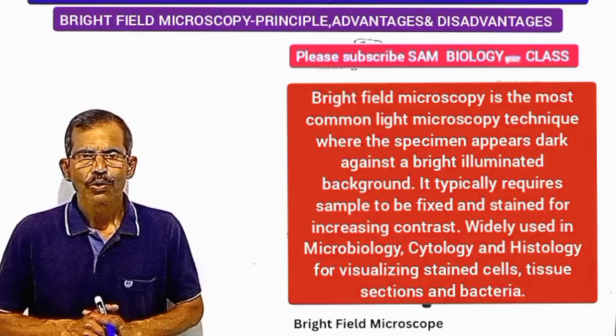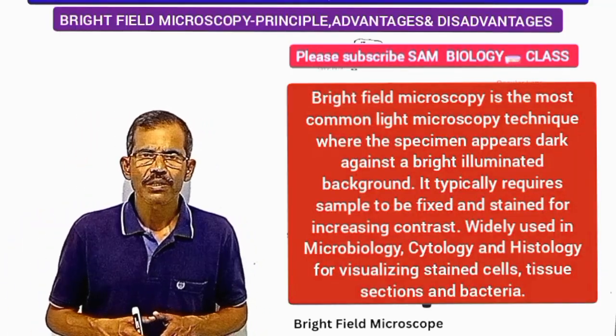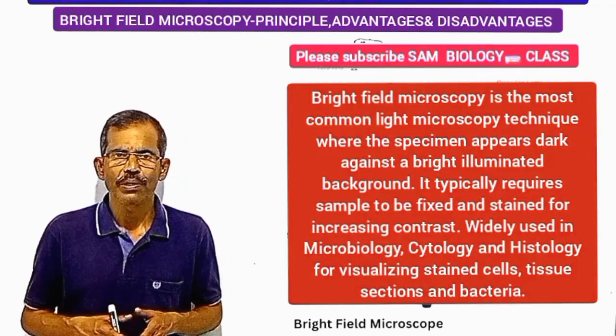Friends, today we will discuss the principal advantages and disadvantages of bright field microscopy.